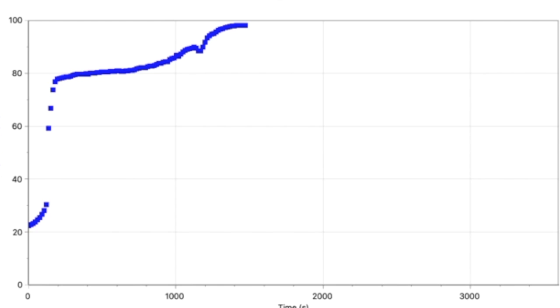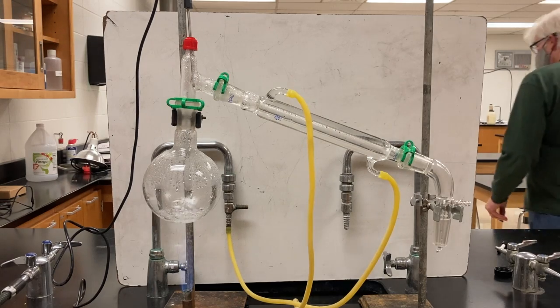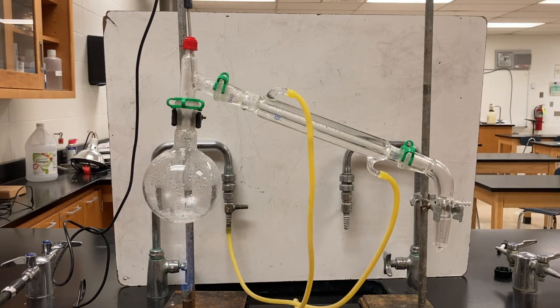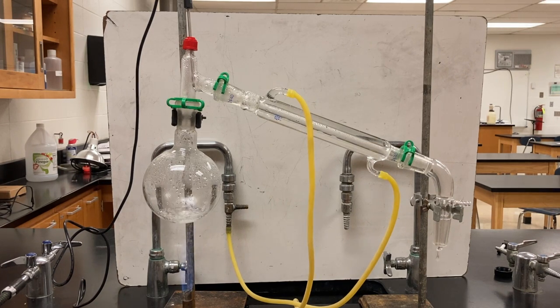Another close-up. Now we can see that the flat spot is occurring right around 100, which indicates that now we don't really have any alcohol left in the boiling flask anymore and we are just boiling water at this point. So what's coming across the condenser and dripping into the beaker that I've put in place is probably now water or very nearly pure water.